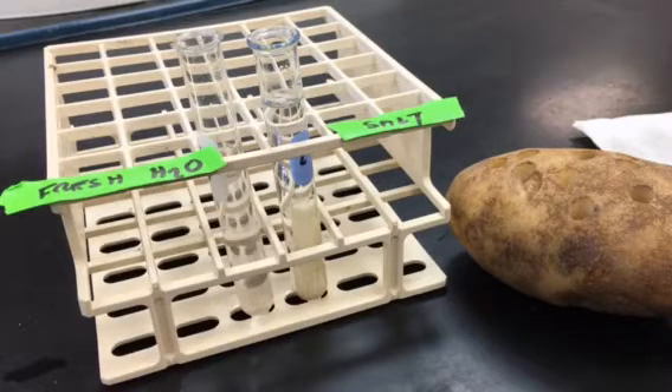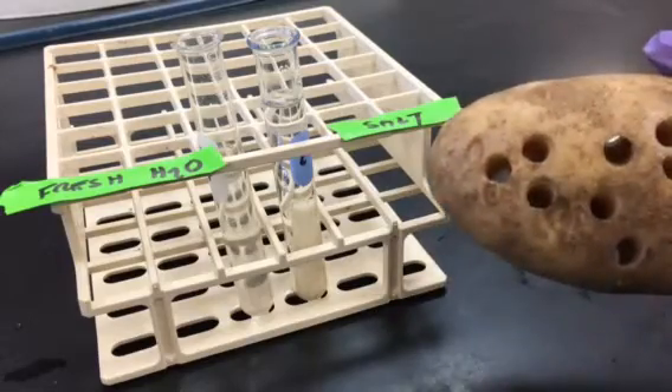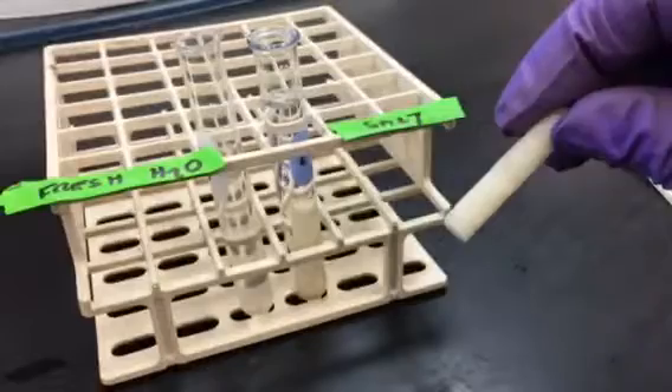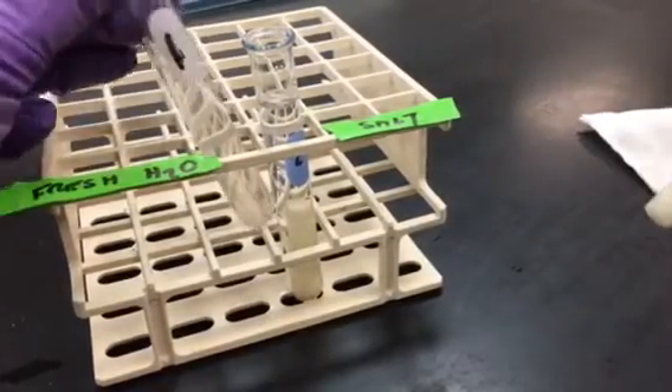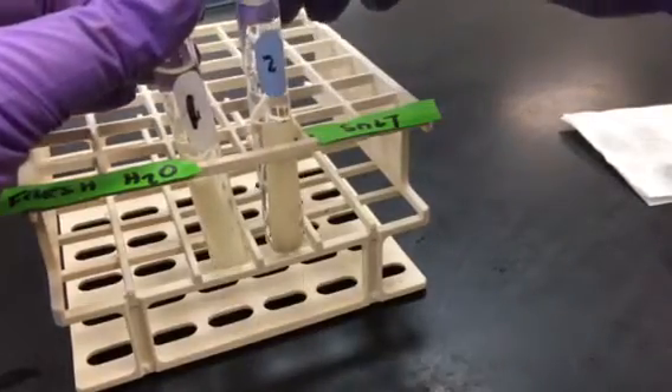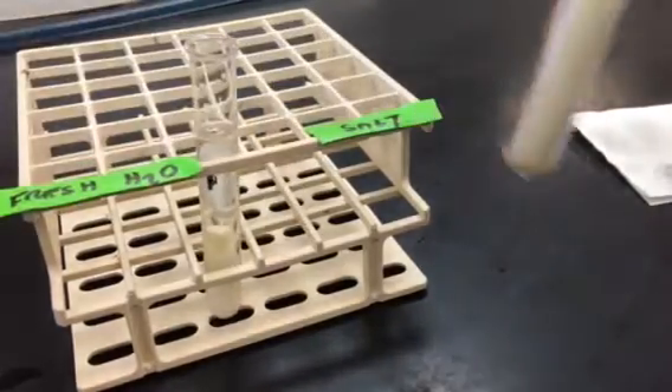This is our video about osmosis, that's the passive movement of water. What we've done is take a potato and core out some samples to get a little potato strip. We're going to place one potato strip in a test tube labeled one — that's fresh water — and another potato strip in tube two, that's salt water.